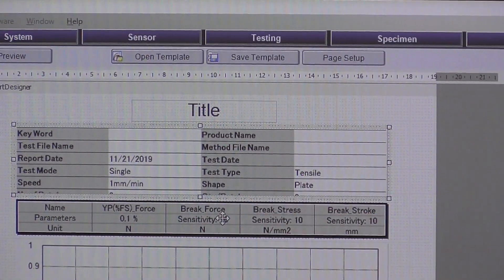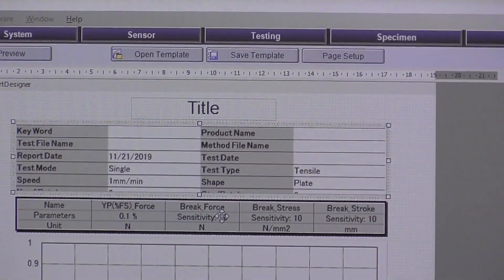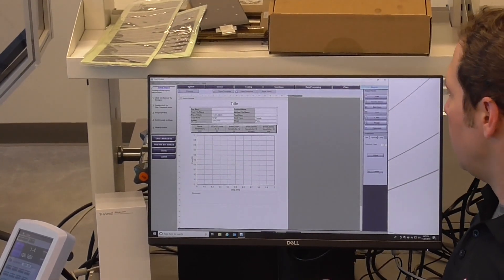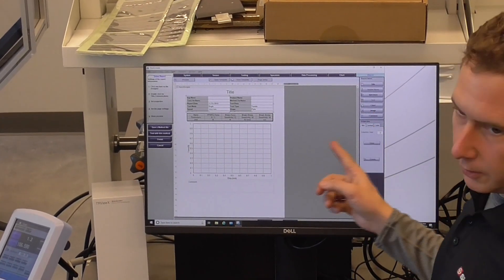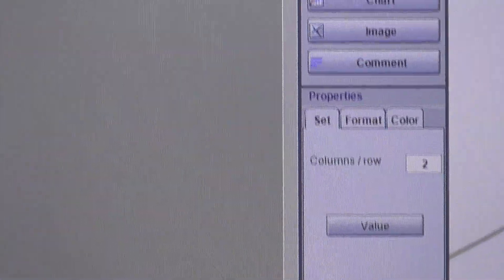Below that are all the data processing parameters that you put in, and below that is your chart. Like I said, you can have your single chart on there, you can have four charts, you can put four charts on there. Lastly, you can also put an image on here, too. You can put school letter name.